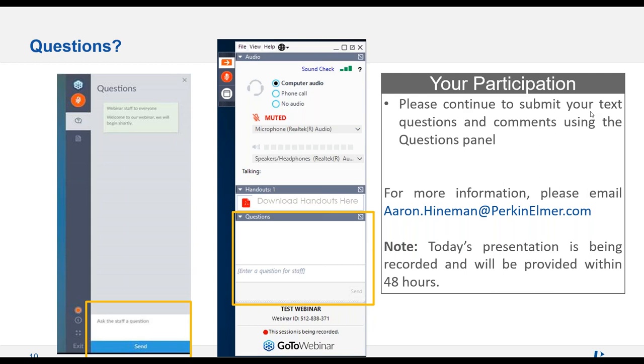Yeah, I've done some of this work years back on these lithium isotopes, and as you said, some of the previous studies showed very, very long dwell times, and to your point, at least on the NexION, I found I didn't need to have these long dwell times, and actually I found by hopping I would get better ratio precision, right? Yeah, I think that's exactly right. That's exactly what we're seeing, at least on the NexION: hopping back and forth really fast, we're getting the same or better precision than if we were to sit there and look longer. Yeah, and that's what I was finding as well.